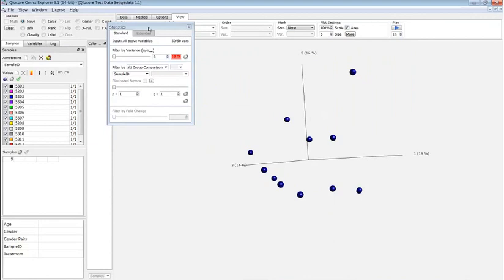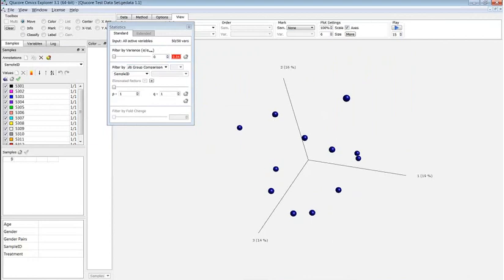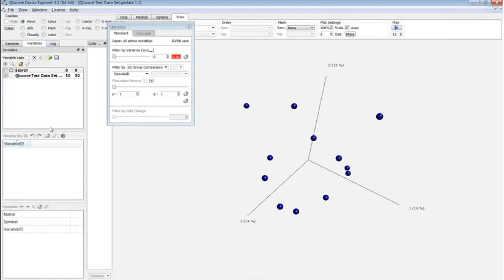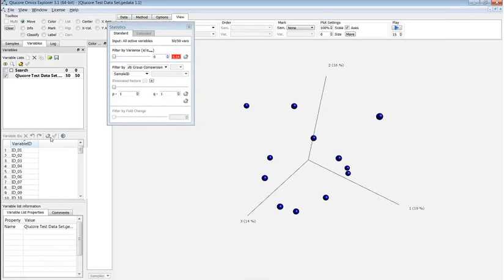And Qlucore, our profile is explorative analysis of often high-dimensional data, a lot of visualization to help the scientist or user to explore the data, finding patterns, extracting information. And we have a lot of tools. For example, you can annotate your data, view existing annotations, create new ones. We have annotations for samples and for variables, for example. And we support a lot of features.